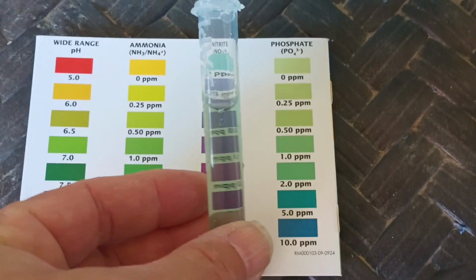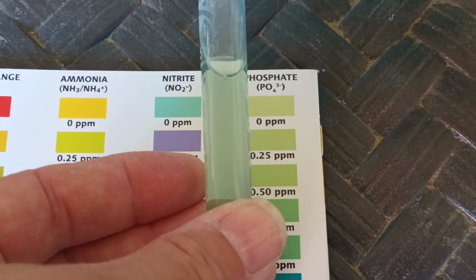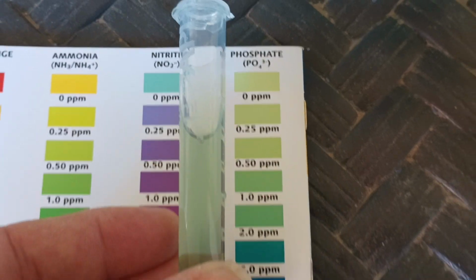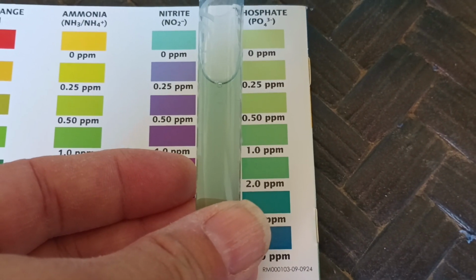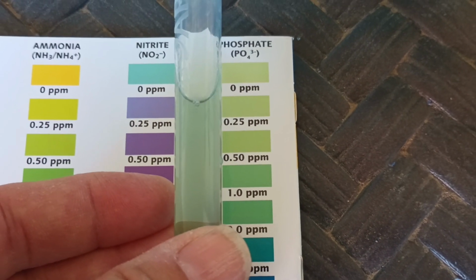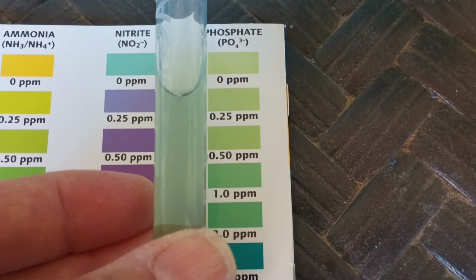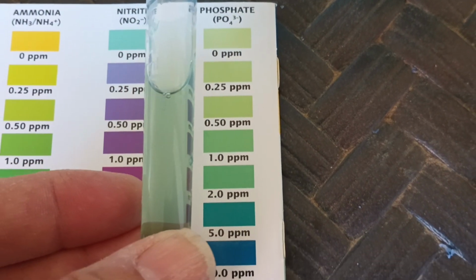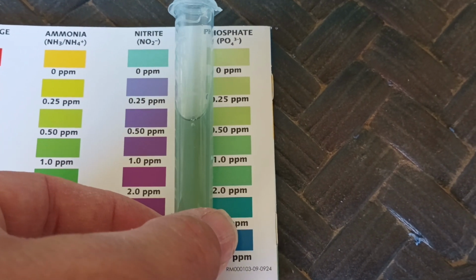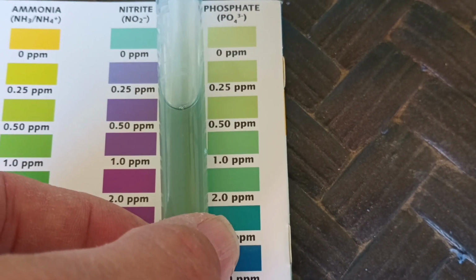Okay, folks, here's the phosphates. Now, where do we think that's at? That one's kind of hard to read exactly. I guess I'd probably put it, from what I can see, maybe that 0.50, 0.50 parts per million. That seem about right to you guys? Maybe that 1. Maybe that 1.0 parts per million there.